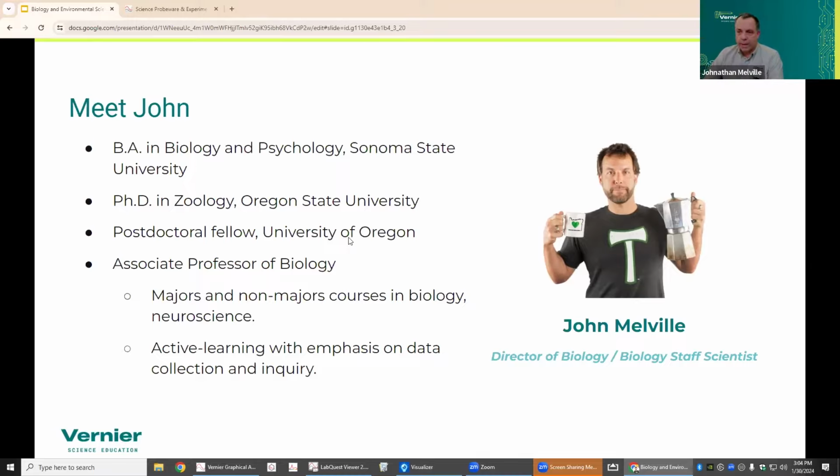My big thing is that I taught majors and non-majors courses in biology and neuroscience, including marine biology. I really liked active learning, and I really tried to emphasize data collection and inquiry in all of my courses. That's really how I got my first experience with Vernier and other data collection platforms.